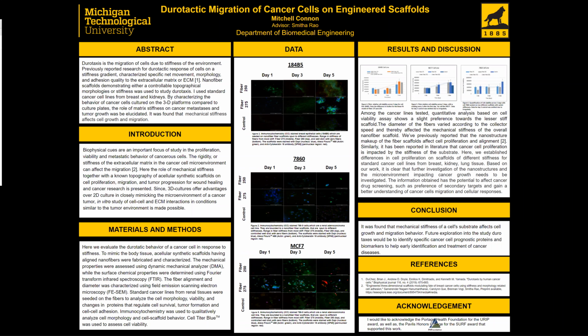In order for cells to grow, they need some support. In a lab, typically cells are grown in culture plates. Research has shown that the stiffness of the material used affects the response of the cell. For example, cancer cells prefer a stiffer substrate.